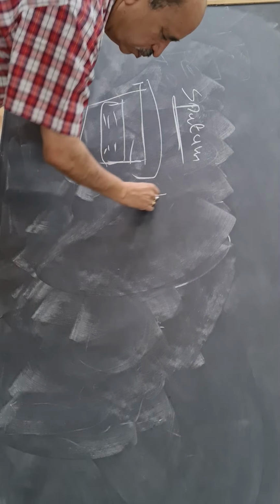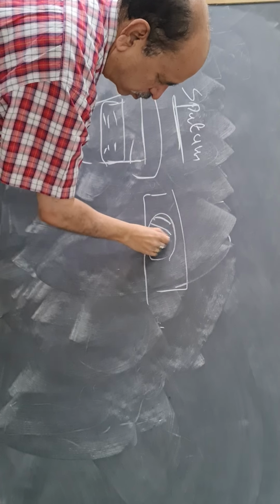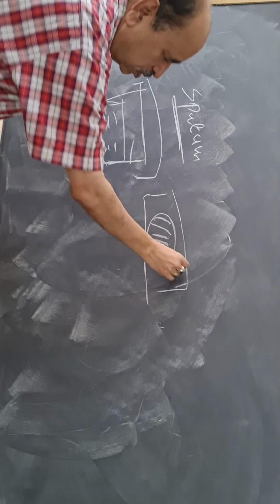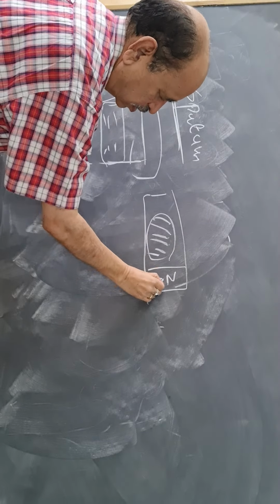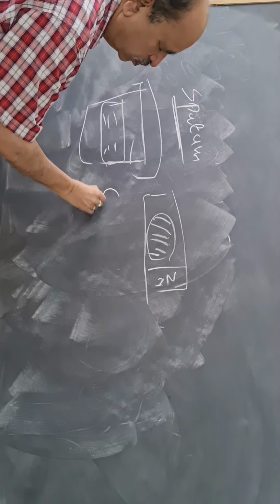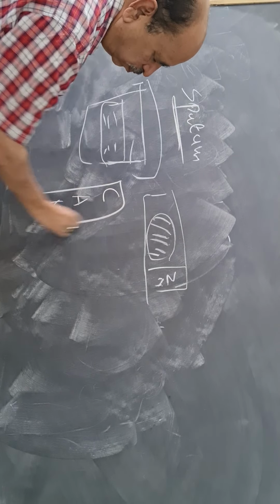Once it comes to the lab, we fix the smear to the slide. Heat acts as a fixative, and usually we put it for Ziehl-Neelsen staining. Now there is a mnemonic.